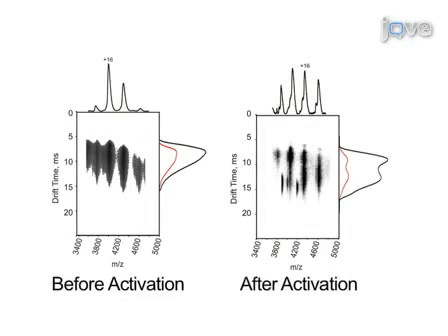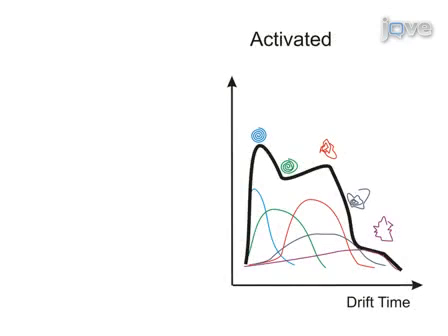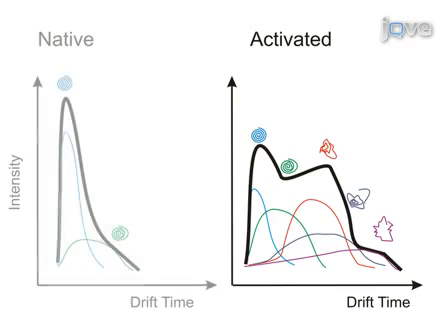To achieve highly resolved MS peaks, protein complexes are often activated within the mass spectrometer to promote the stripping of residual water and buffer components. However, if the activation energy is increased beyond a threshold value, partial unfolding can occur, forming multiple intermediate states, which are unlikely to correspond to the native solution state structure. As a result, the drift time peak may be shifted and broadened, reflecting the heterogeneous population of unfolded structures.